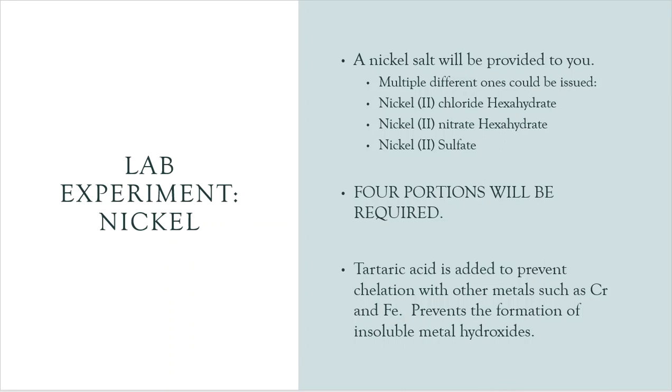What are these hydrates? Well, hexa means 6 in a laboratory, and hydrate, if you hydrate yourself, what do you do? You drink water. So 6 water molecules. That means I've got nickel 2-chloride, a little grain of crystal right there, and then around that nickel 2-chloride, 1, 2, 3, 4, 5, 6 waters, all the way around, 6 water molecules. That's what a hydrate is. So there's some water weight that's assigned to these crystals, because water loves to hang out at the BFF's house, on the weekends especially.